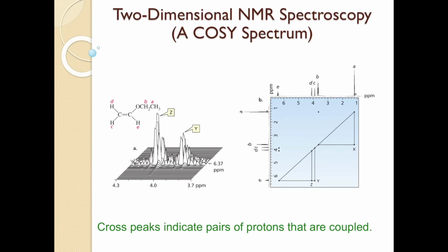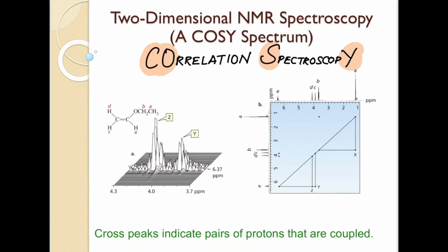The next important technique that we have here is two-dimensional NMR spectroscopy.